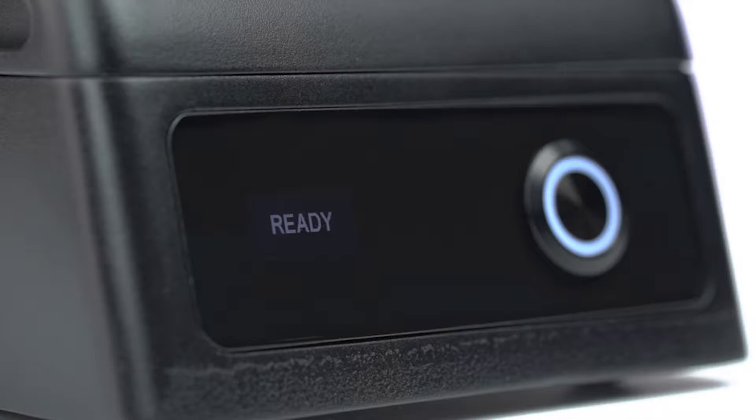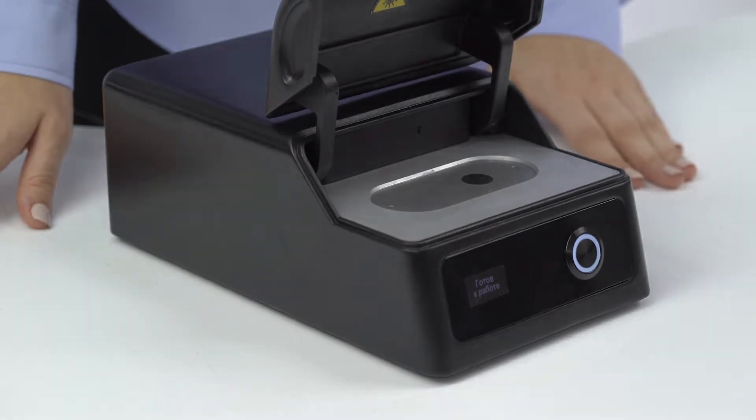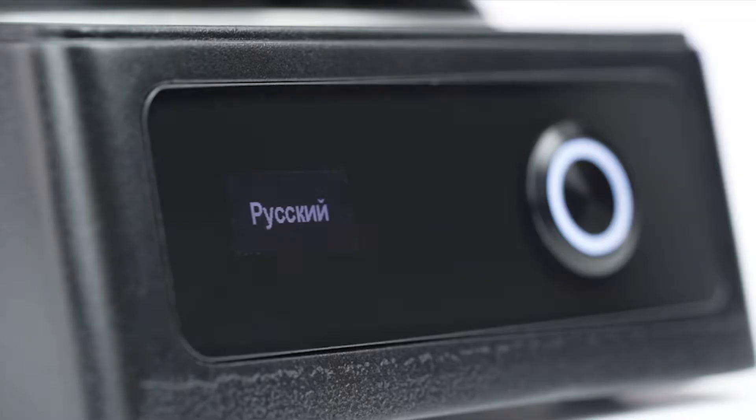After loading, the display text changes to show the device is ready. We can choose the interface language. The language switch button is right under the cover. Press the button and text will appear on the device display corresponding to the chosen language — Russian or English.